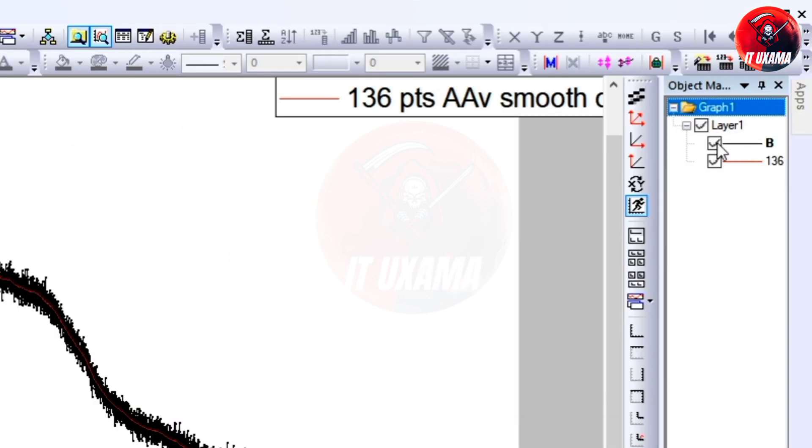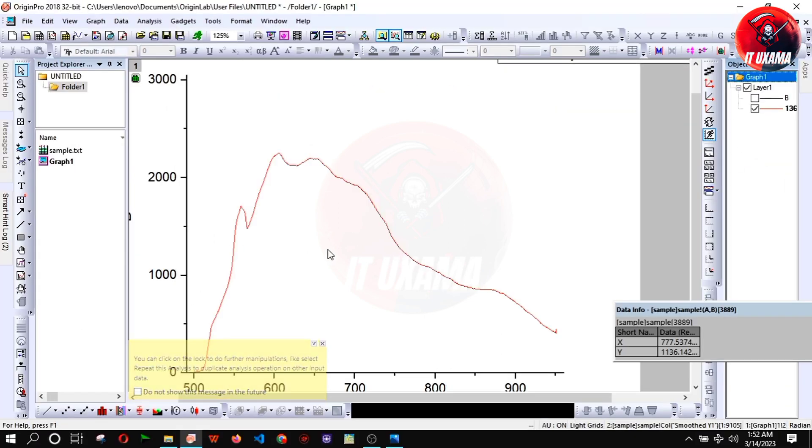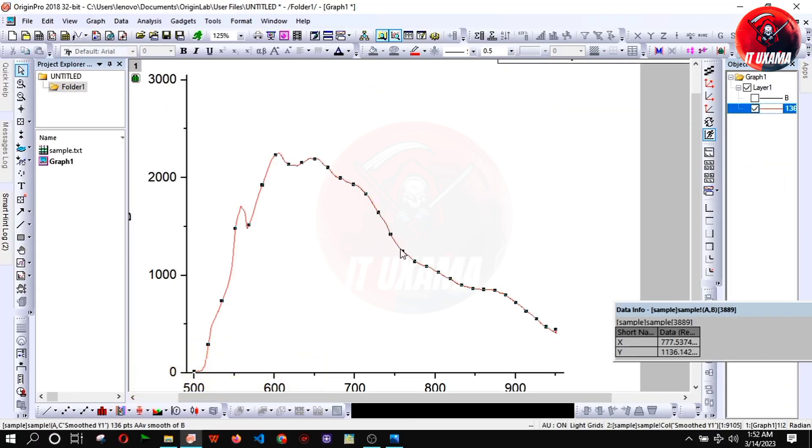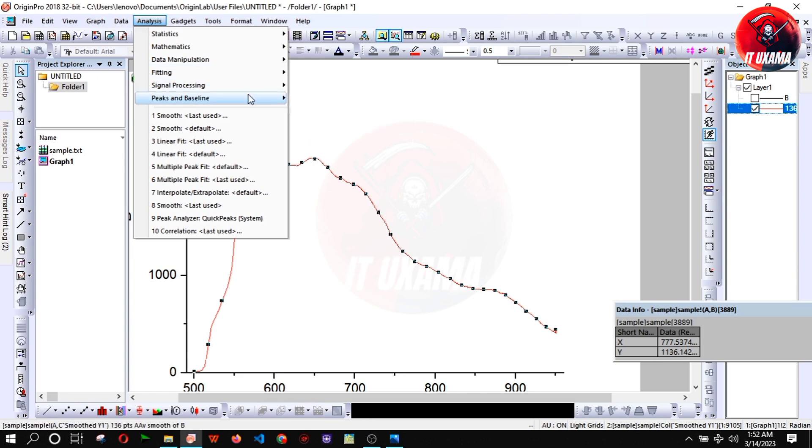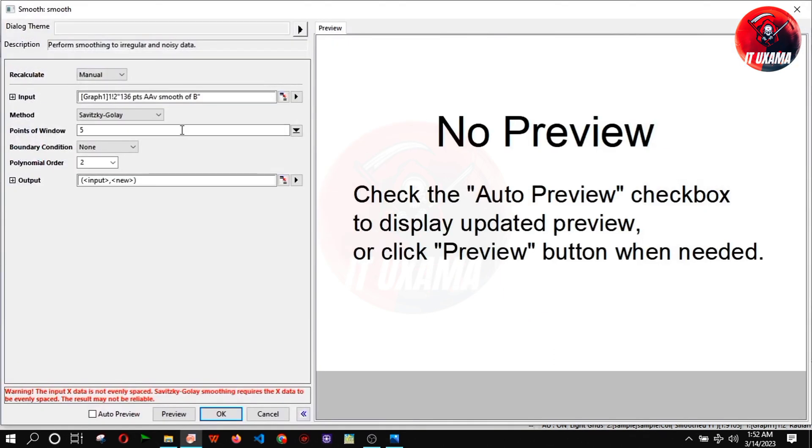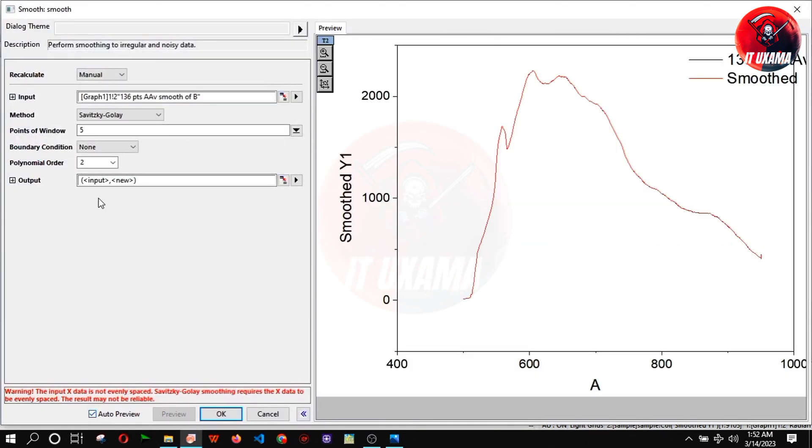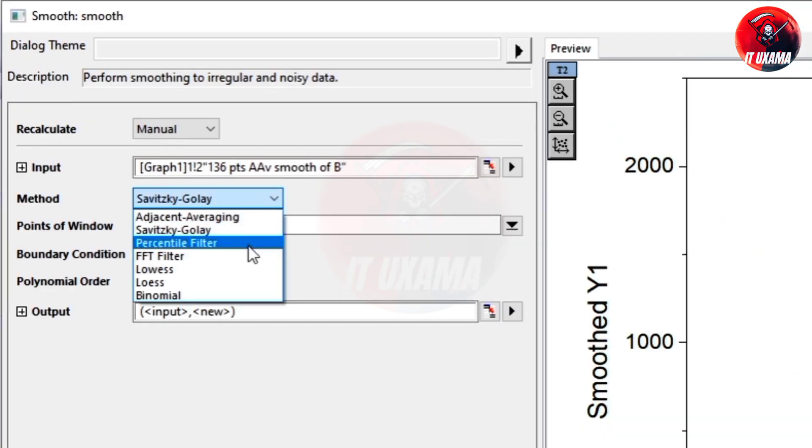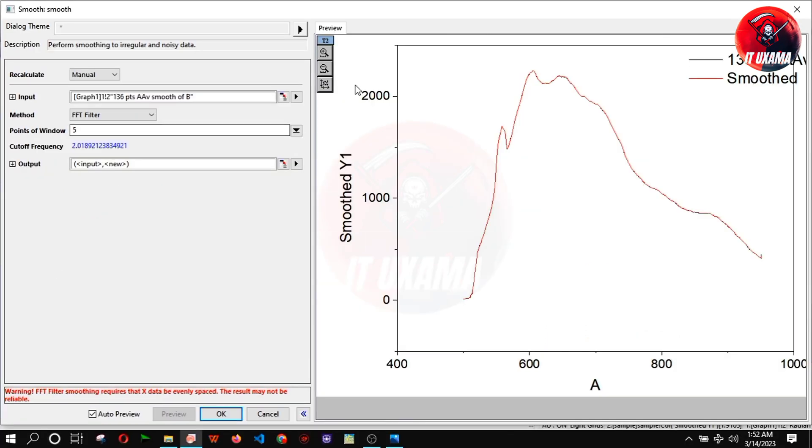Hide original curve. Again select the peak and go to analysis, signal processing, smooth, open dialogue. But this time use FFT curve fitting. FFT filter will make the curve continuous.